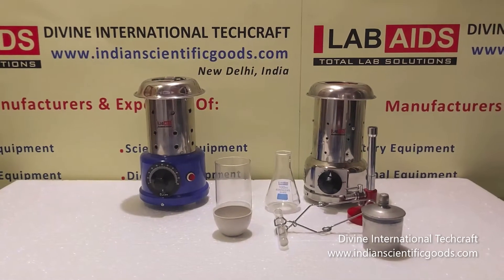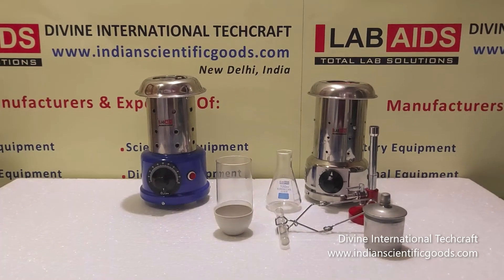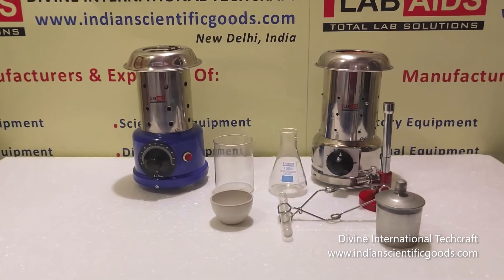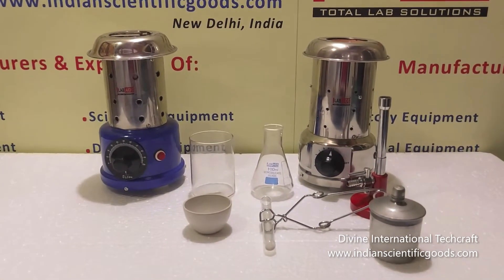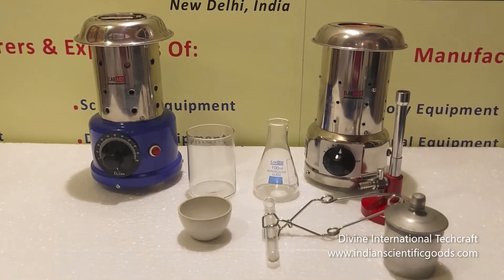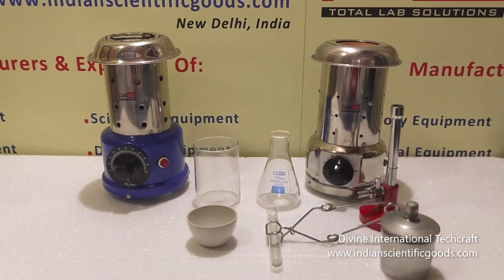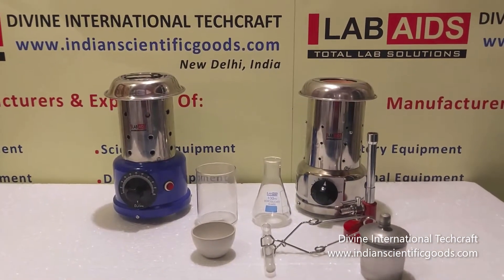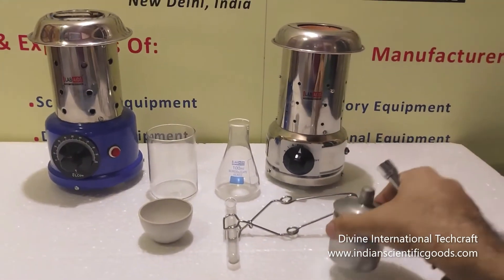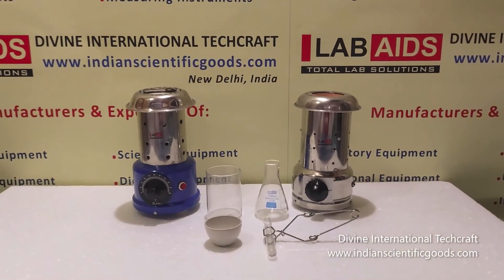Hello. These are electric Bunsen burners manufactured by Divine International Techcraft, New Delhi, India. These electric Bunsen burners are flameless and work without gas. These are ideal for rooms that do not have a gas supply. These are also suitable for locations and applications in which no open flames are allowed. You may now discard your traditional gas burners and spirit lamps because these electric burners are much safer to use.